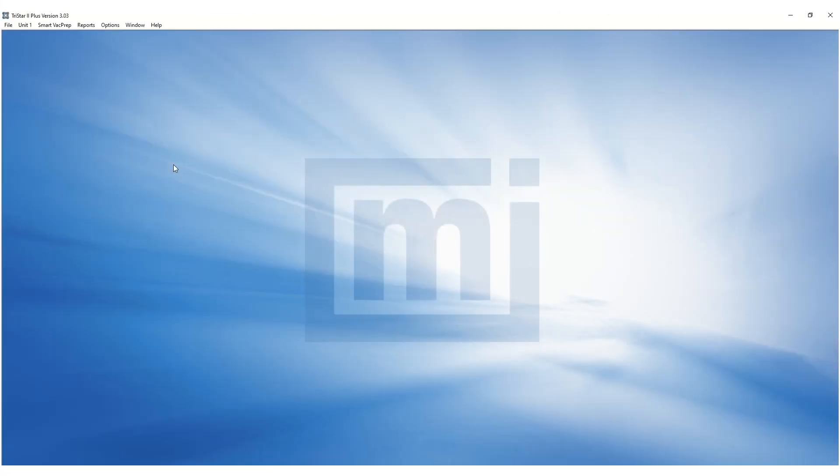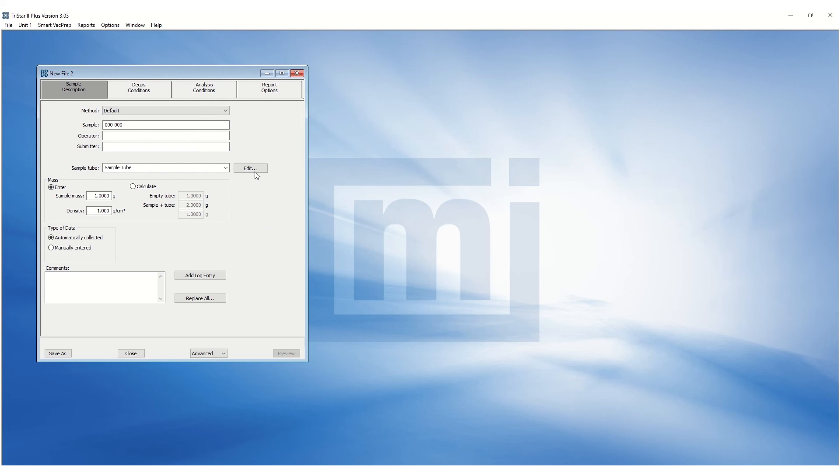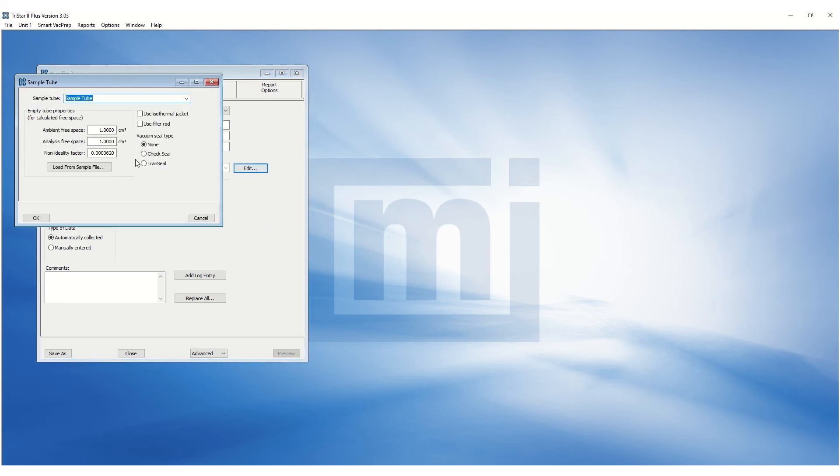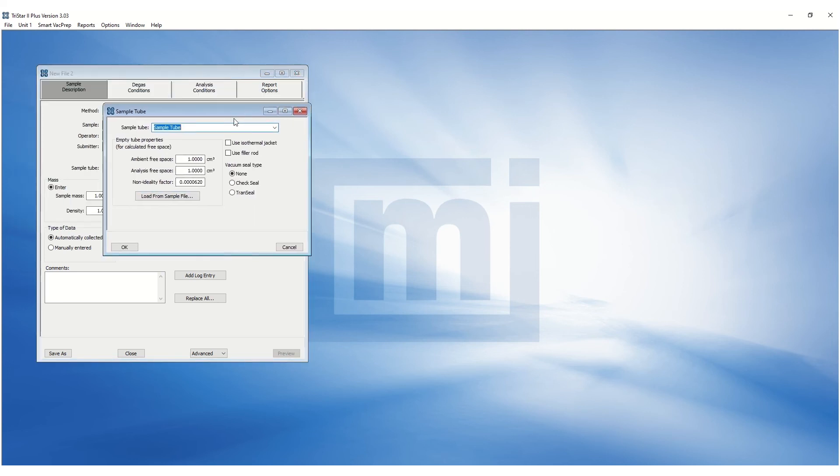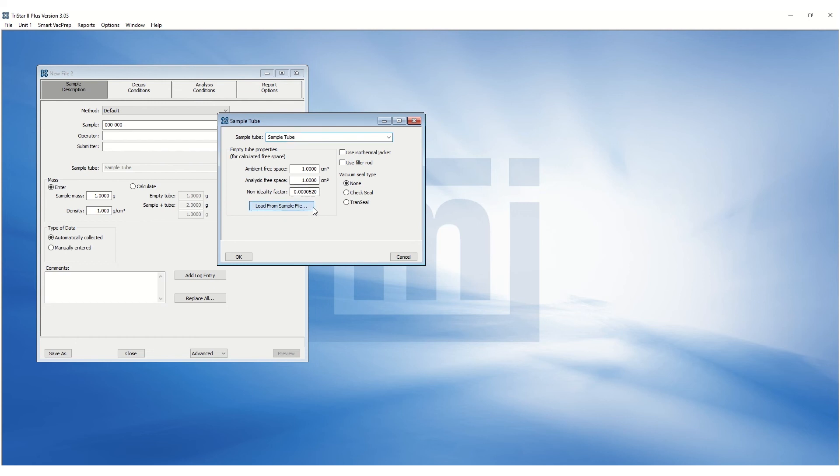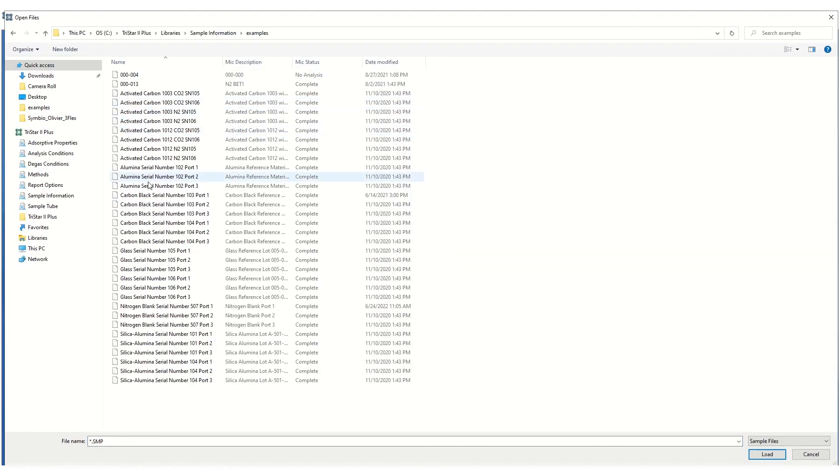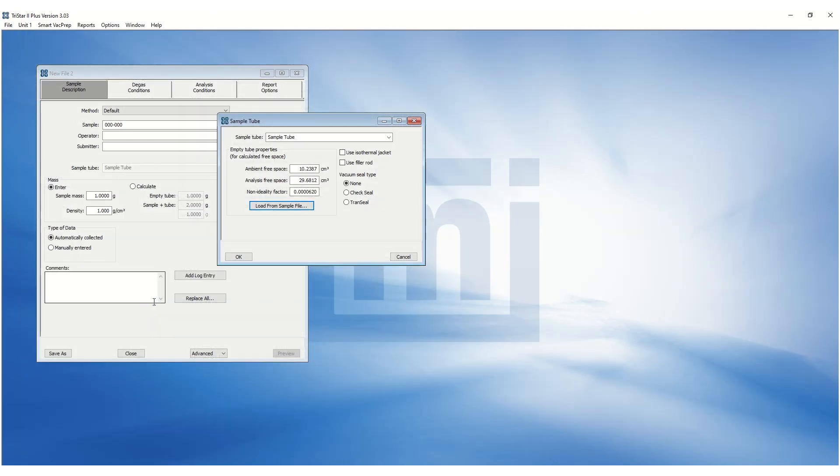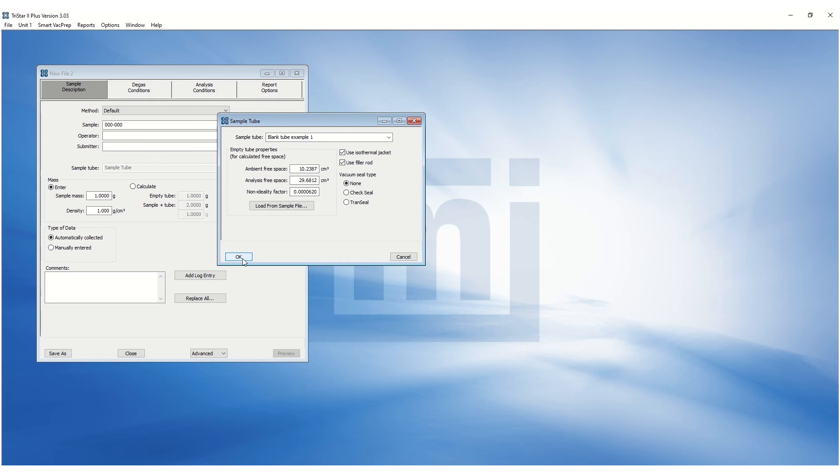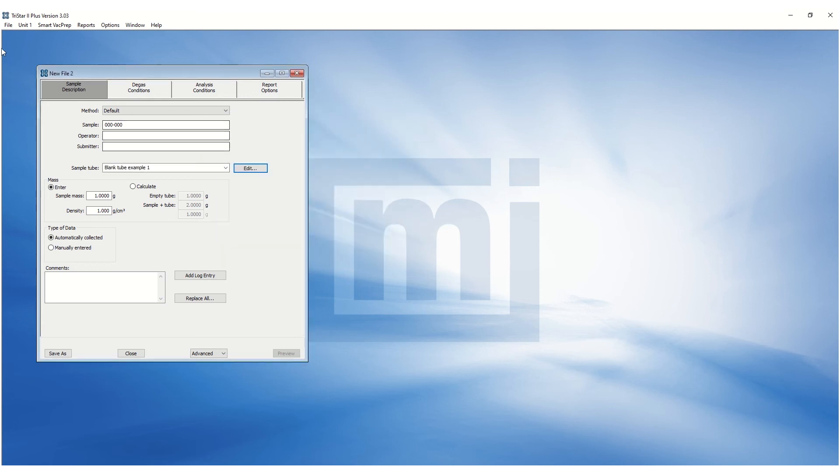The blank tube analysis SMP file should be saved as a sample tube properties file. Open a new sample file and click on the Edit button for the sample tube and click Load from sample file. Browse to load the blank analysis of the sample tube. Once loaded, rename the sample tube appropriately for future reference. Check the appropriate sample configuration information, such as isothermal jacket and filler rod, and then go to the File menu and click on Save As.